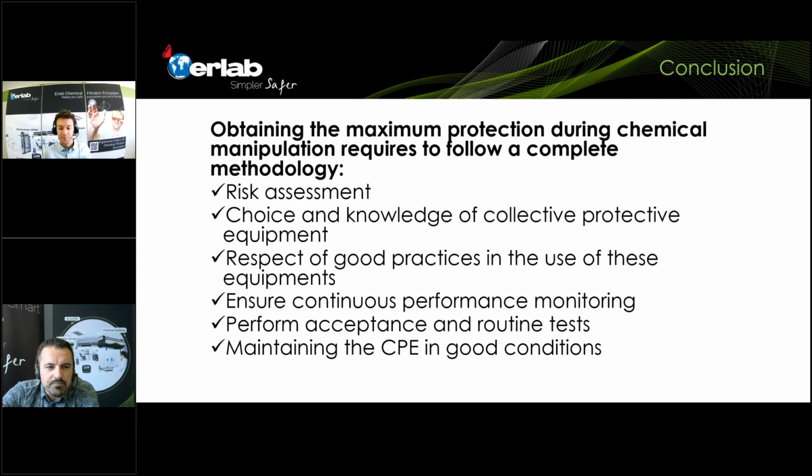So we also received another question which is related to this topic from Vasily Mitz, who asks: a ductless fume hood is not intended for huge fuming, but how much fuming is considered huge? Are there any numbers?